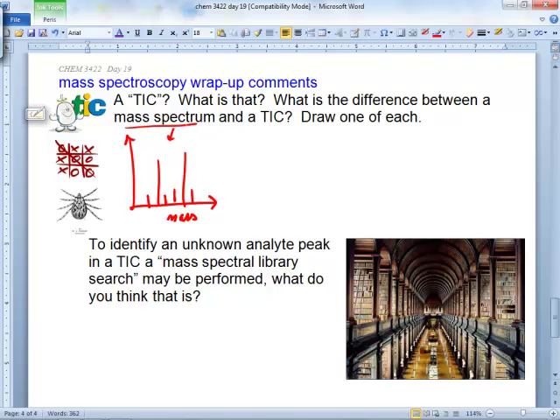There's a mass spectrum. Right? To appreciate what's going on here, you have to realize how fast this thing is operating. It just analyzed from extremely low mass, maybe like 20 or 18 grams per mole, all the way up to like 250 or 300 grams per mole, molar mass, roughly, in a microsecond. So it scanned, I mean, it's crazy how fast this thing can do that. But it takes a microsecond, right?